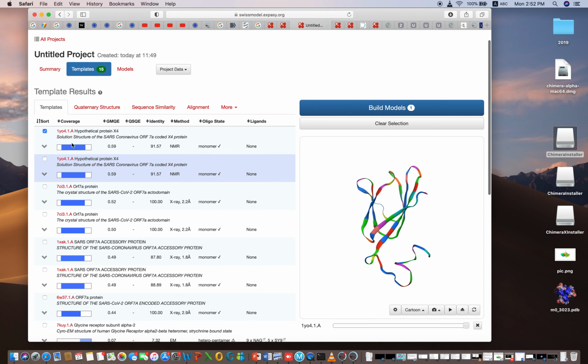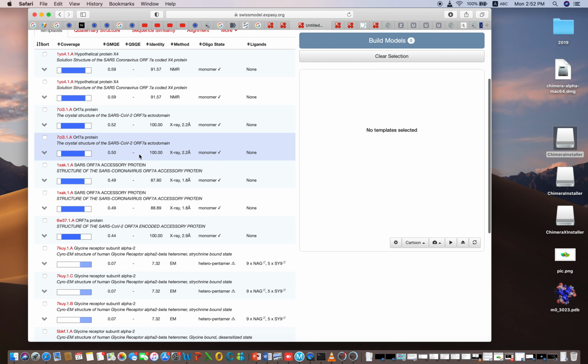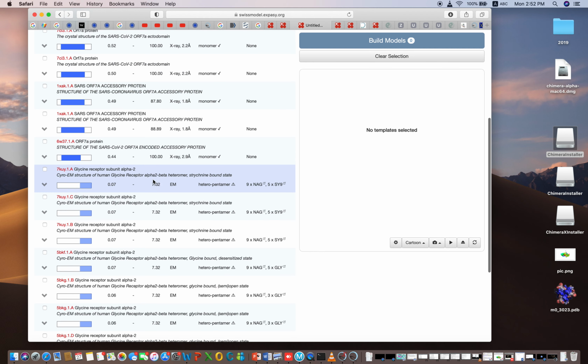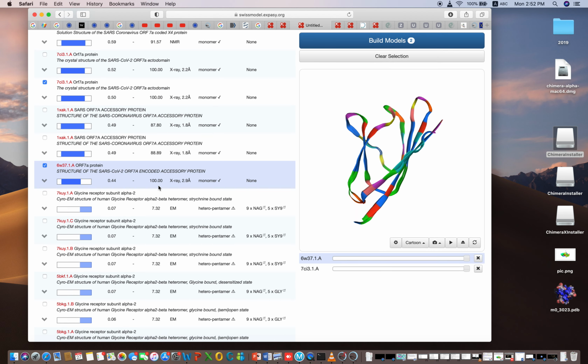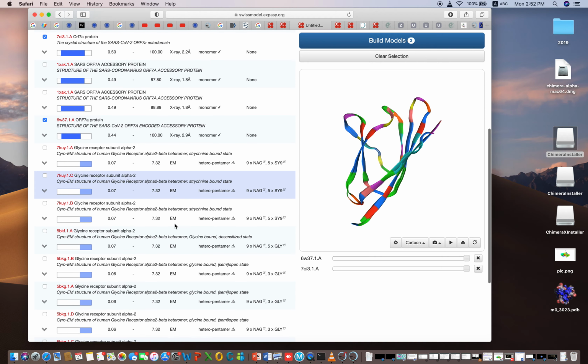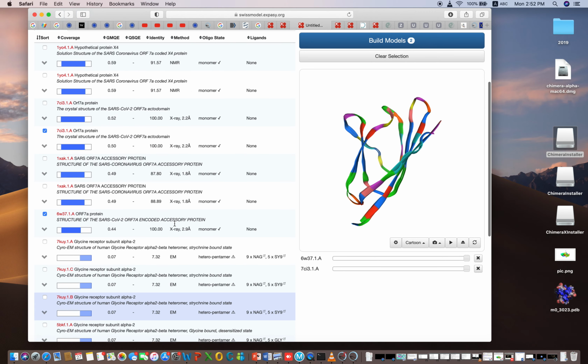Yes, it has completed. If you choose, like I have chosen this one with 100%, only identity is not the criterion to select the template.